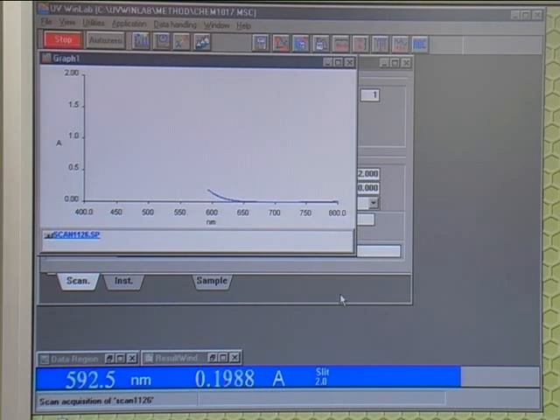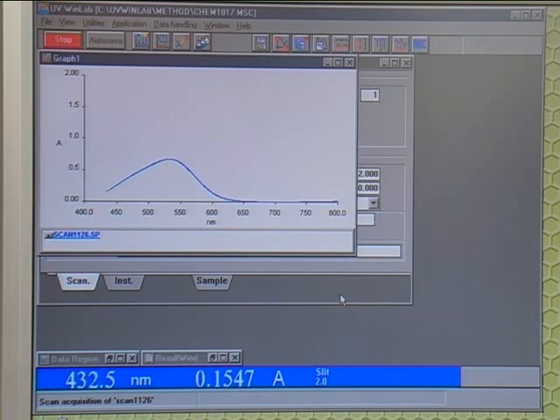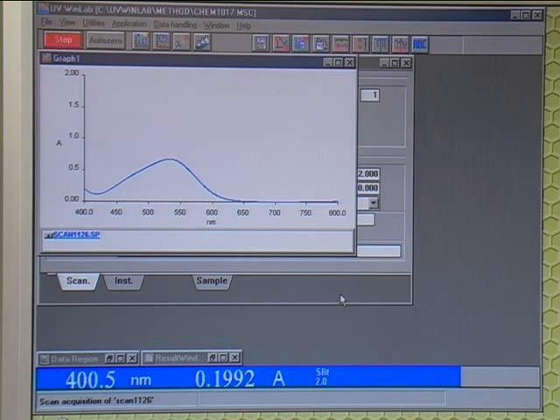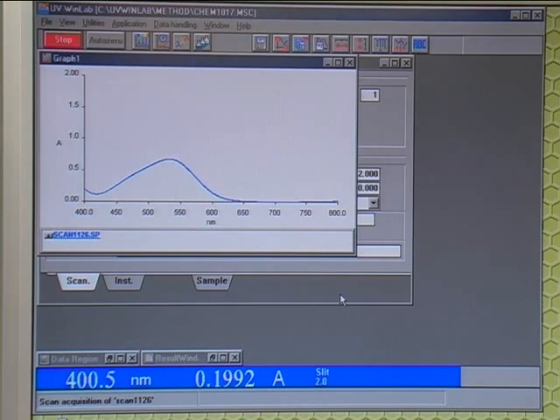Try to ensure that the concentration of your solution isn't too strong, so that the peak goes above the graph, or too weak, so there is no peak. The example shown here is about perfect.